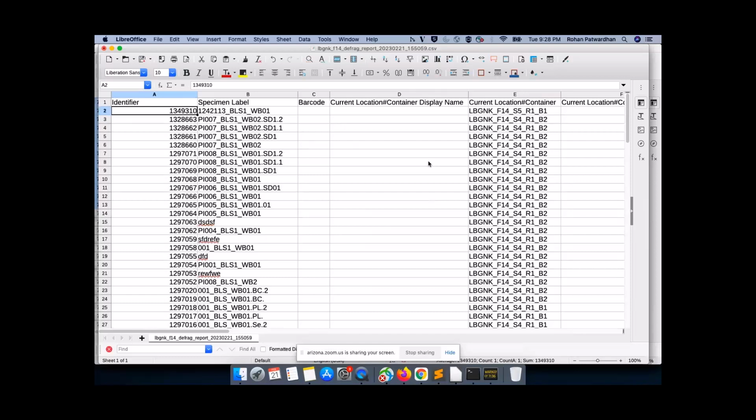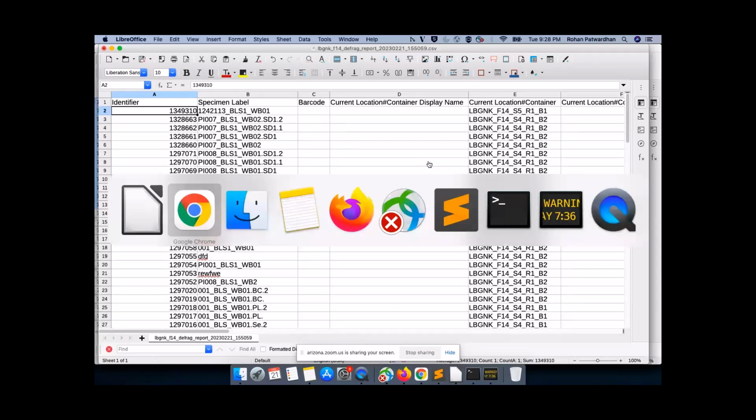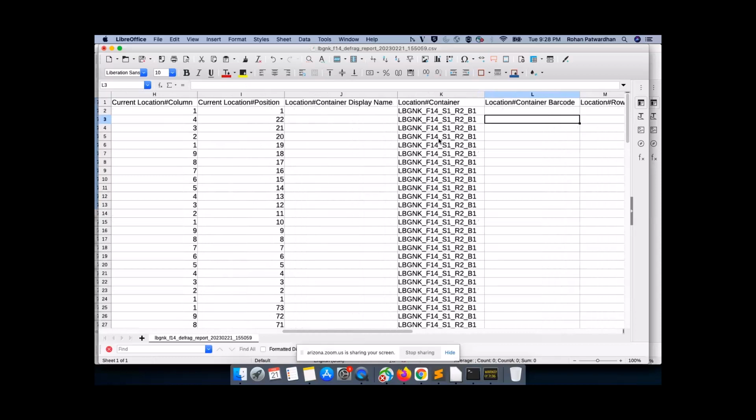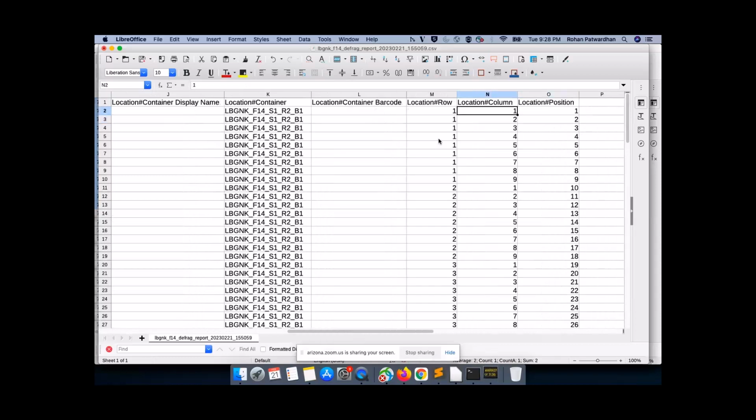Even to be frank, I'm not really 100% sure what your use case is and how that needs to be done. But one simple tip is, whatever your destination locations are, you can also change them manually if you want.